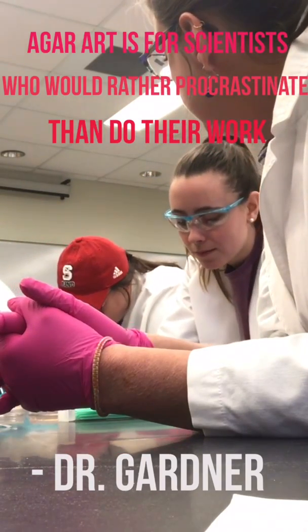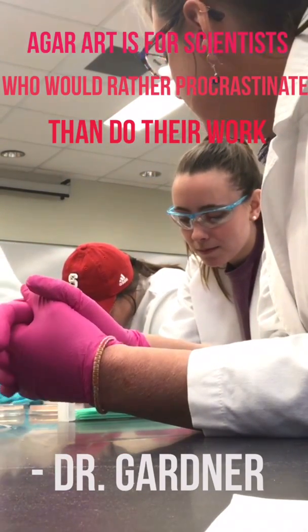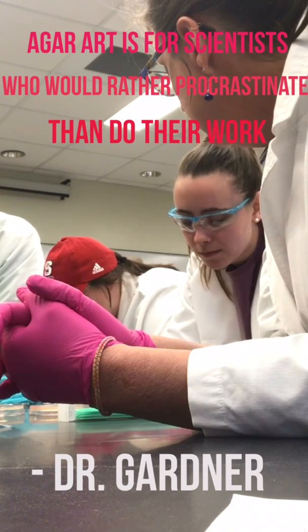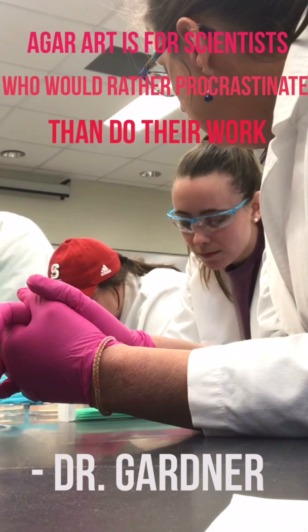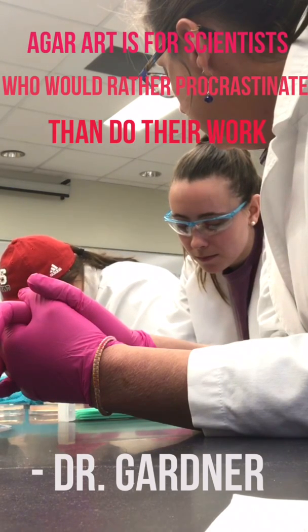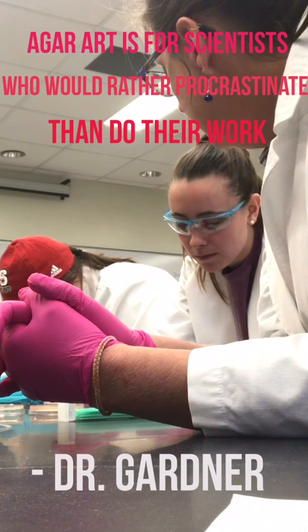This smells bad. Yeah, no, Serratia really stinks. Oh, jeez. Oh my god. It smells like fish.